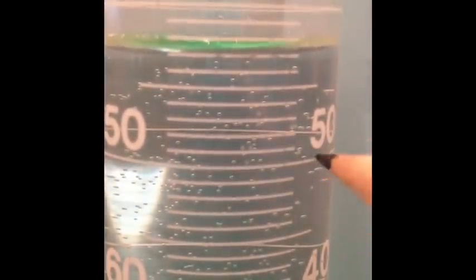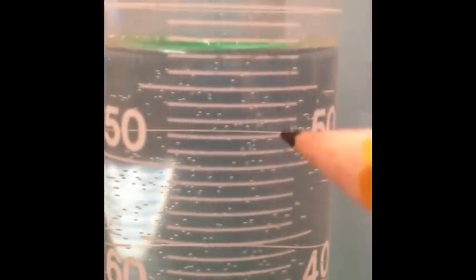Again, here's my 50 line. 51, 52, 53, 54, again 55 is a little bit longer. Then I have 56. Now I want the bottom of that curve again.